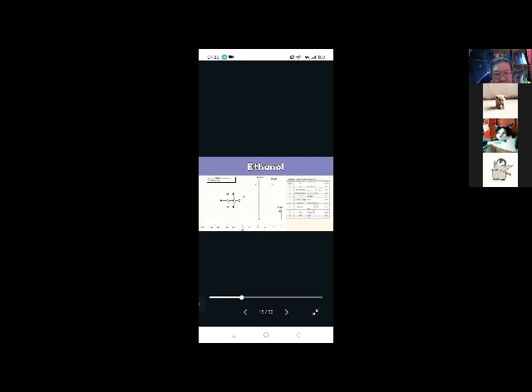Other than knowing how many peaks there are in a molecule, they will sometimes ask you about the range, which is where the peaks are located in the spectrum. You can find that very pixelated table in your data booklet on page 13. To make things easier, I zoomed it in on the next slide.